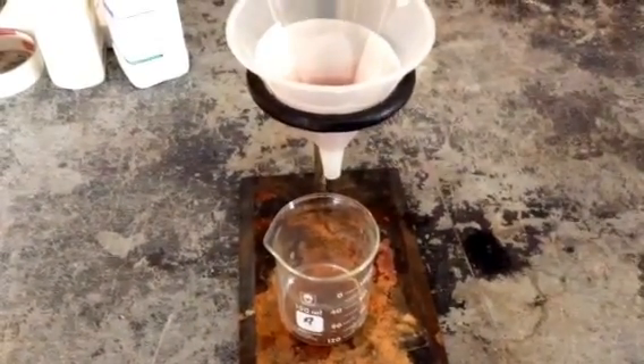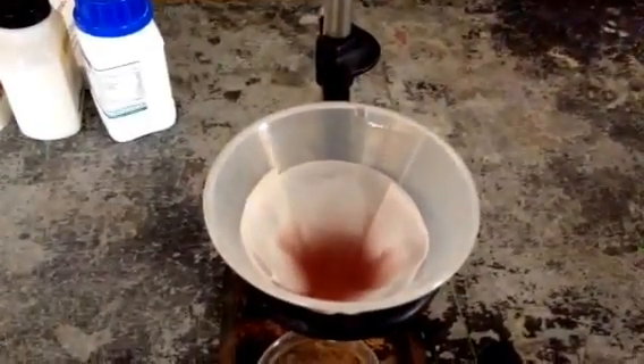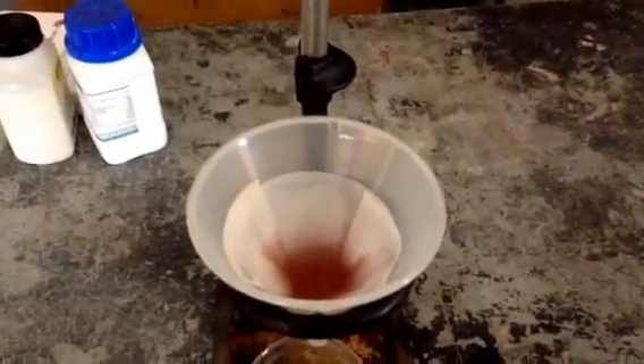Let's focus that up a little bit. See in there? It's going to collect a little bit of liquid and it's going to drip down.